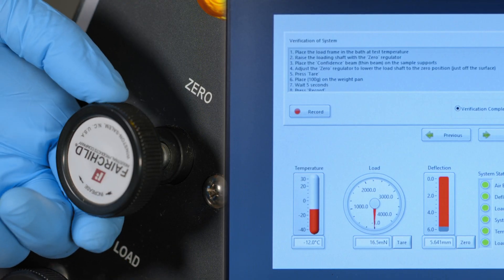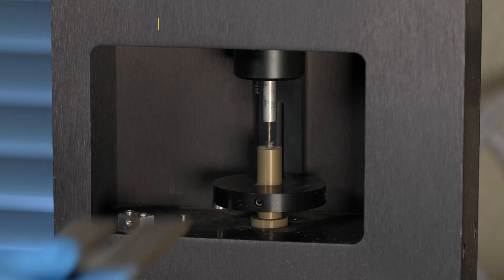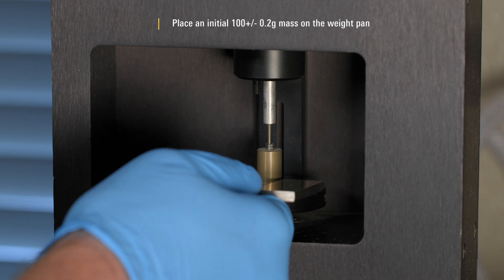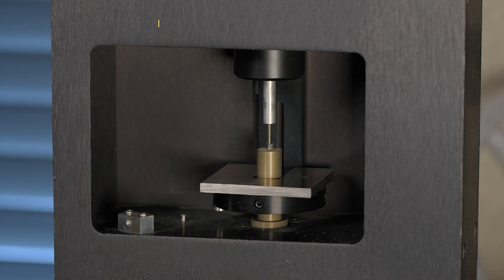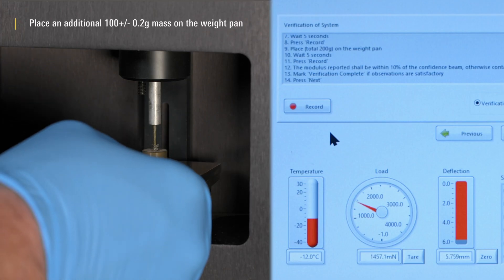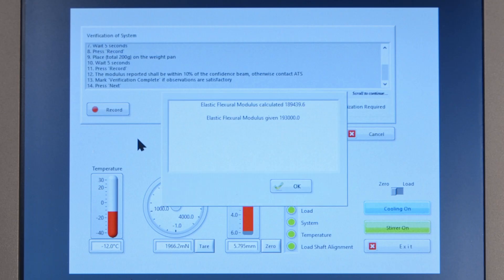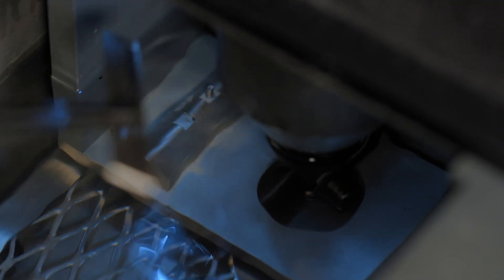Overall System Check. Place the thin steel beam into the bath. Use the zero regulator to place the load nose just off the surface of the beam and tear the readout. Place an initial 100 plus or minus 0.2 gram mass on the weight pan; wait 5 seconds and press record. Place an additional 100 plus or minus 0.2 gram mass on the weight pan; wait 5 seconds and press record. The measured modulus must be within 10% of the modulus provided by the instrument manufacturer. Remove the thin steel beam.